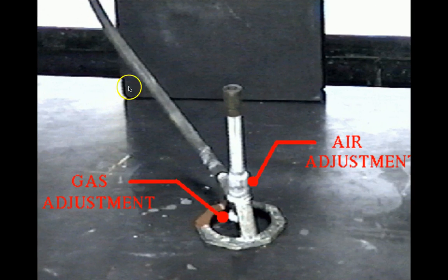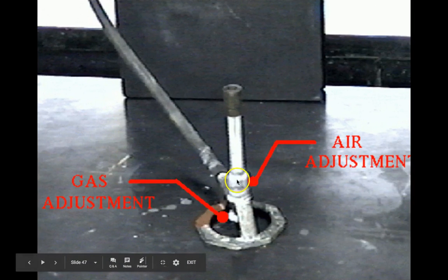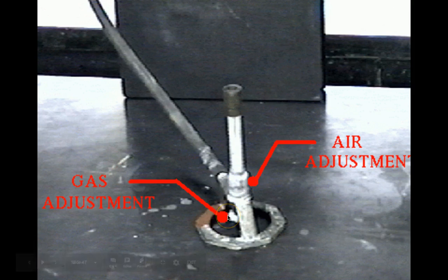Here's what a Bunsen burner looks like. Up here controls the air, and down here controls the gas. Don't put your hand on the top part — you will burn it. The lower part is only a little warm and you can operate it safely. The gas control makes the flame larger or smaller. I've had people accidentally burn themselves by touching the top part, even after the burner is off — so always be careful.